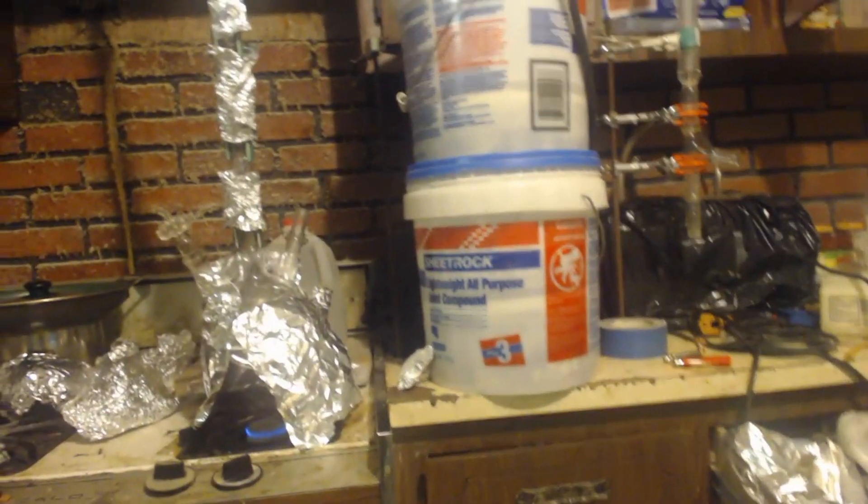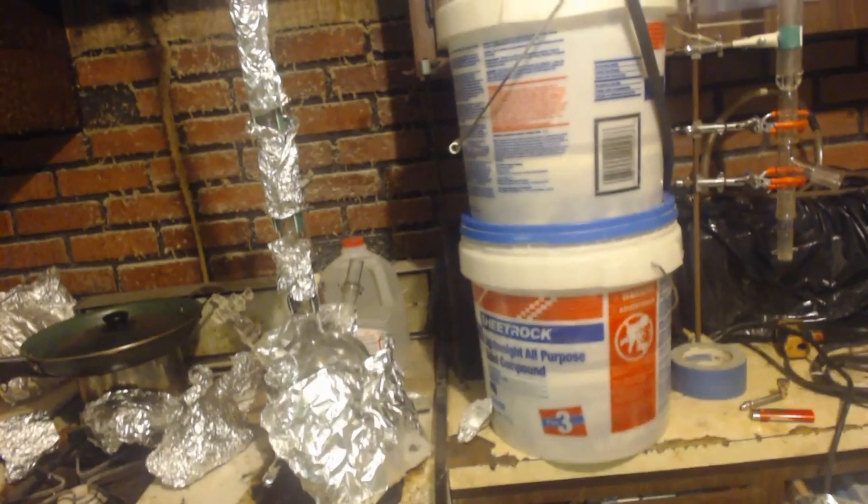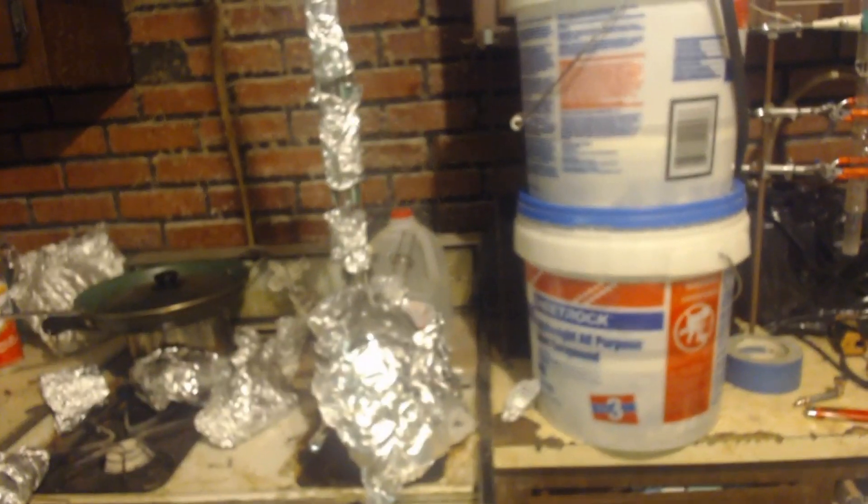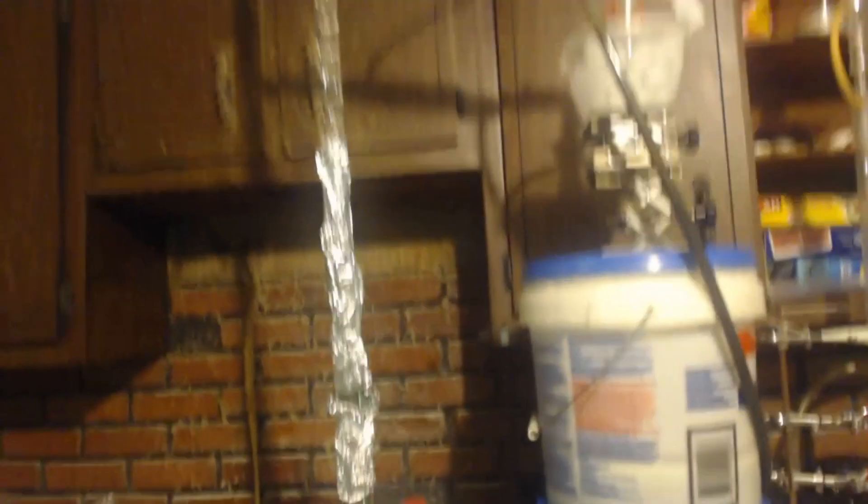Remember what was in the bubbler — it has the vodka in it, which has all the product. Here's my apparatus. That's the stuff from the bubbler and the stuff I distilled out from it; it trapped it out of the ethanol mostly. We found out there's only about a milliliter of acetaldehyde in there.